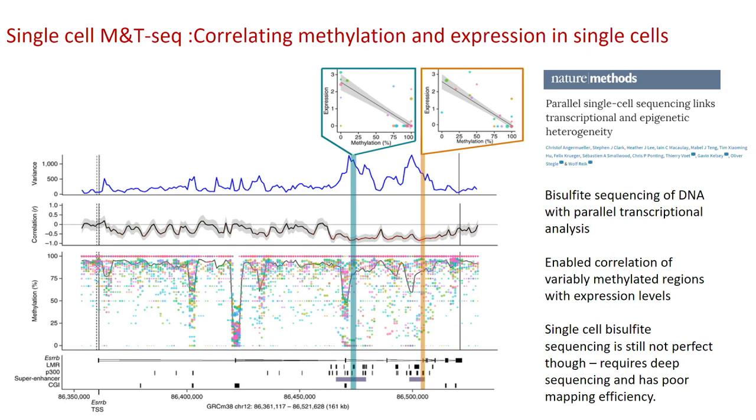So you're starting with a limited copy number, ideally, in a normal cell, two copies. You have a lot of opportunities to lose the material that you want to sequence. First of all, just in terms of dropout that would happen with any enzymatic treatment, but also in terms of the bisulfite treatment of the DNA. So you lose a lot of material.